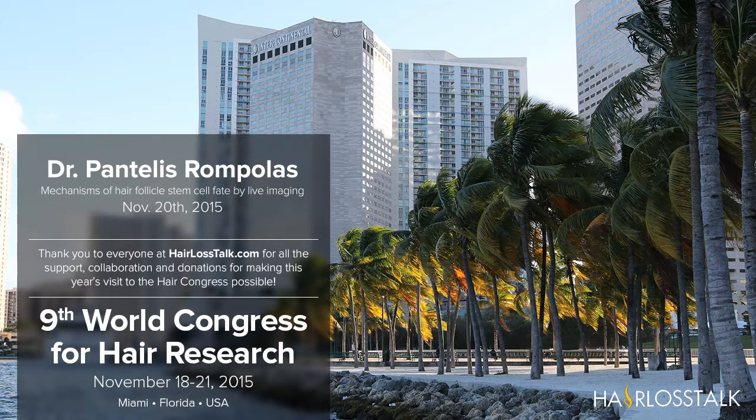And this is a summary of these experiments. We labeled different areas of the hair follicle and traced these hair follicles up to the telogen state. And what we found is that cells in the upper outer root sheath are the ones that survive the entire catagen and the ones that make up the new hair germ.